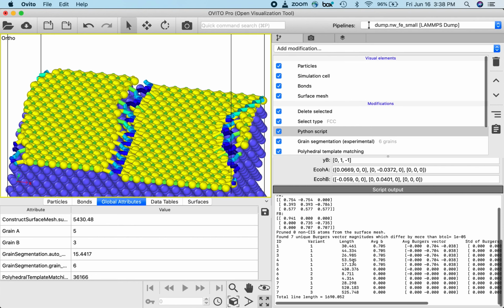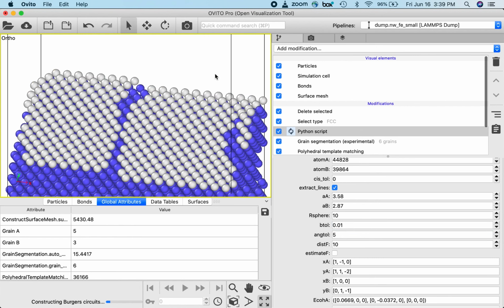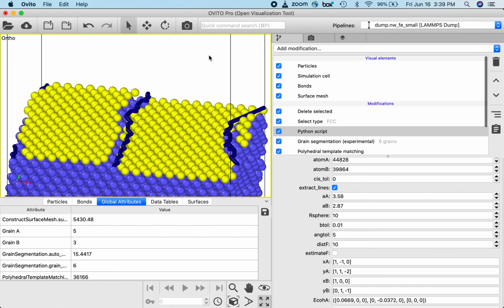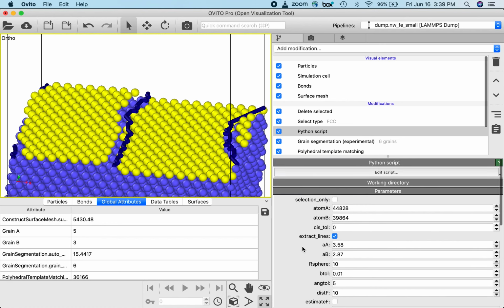Anyway, that gives you a sense for how it behaves. If you know your crystal orientations, and you already studied the interface, and you know how the crystals need to be oriented for it to be coherent, you can just run it with the manual mode and you will get exact Burgers vectors out. And again, if you run into this issue where you punch stuff in and there's line defects everywhere, it's because there's some issue with the particular reference orientation that you've given it.